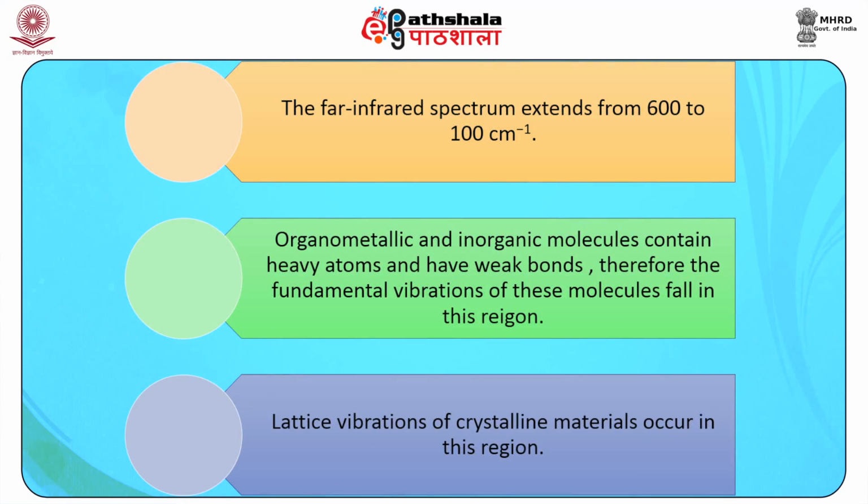The far infrared spectrum extends from 600 to 100 centimeter inverse. Organometallic and inorganic molecules contain heavy atoms and weak bonds. Therefore, the fundamental vibrations of these molecules fall in this region. Lattice vibrations of crystalline materials occur in this region too.